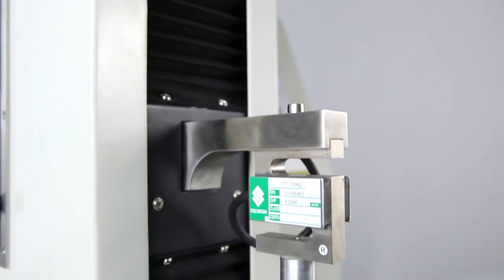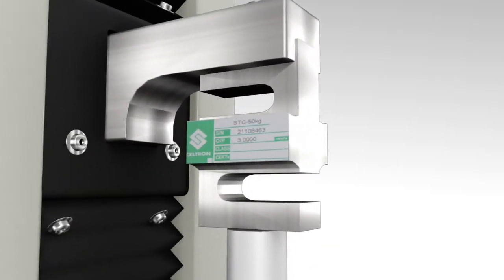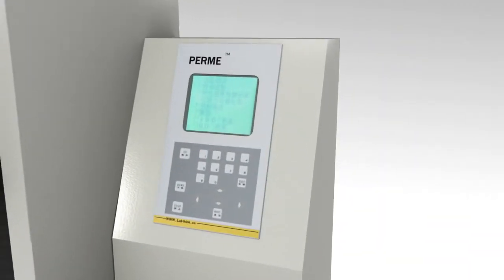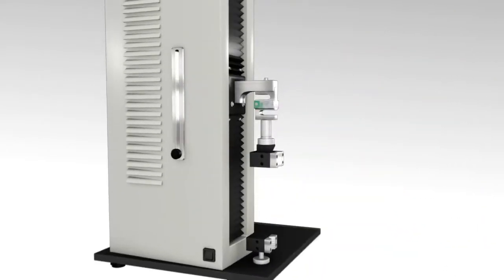XLW-PC is a professional tensile tester for flexible packaging, which uses an ultra-high precision load cell and possesses the functions of power failure memory, overload protection, over-travel protection and automatic positioning set.